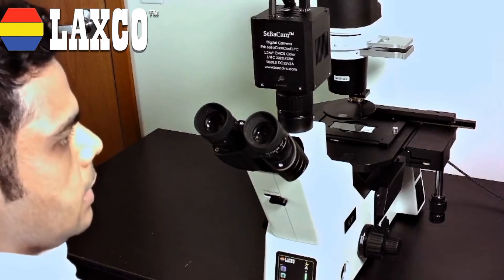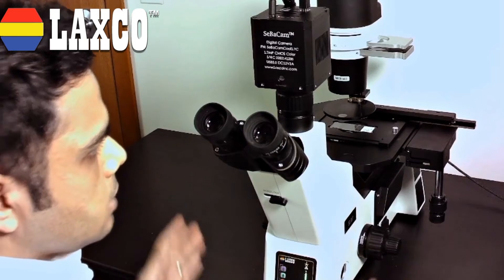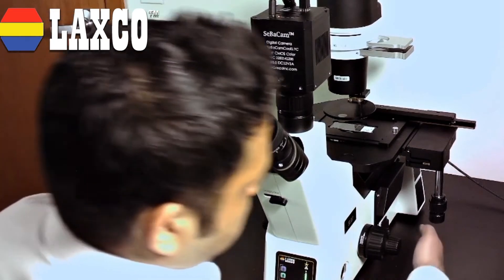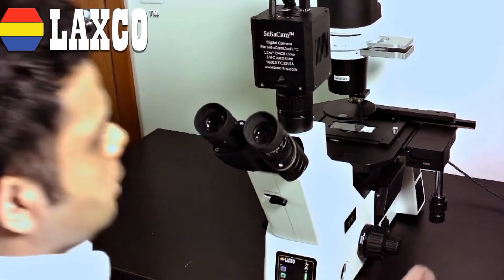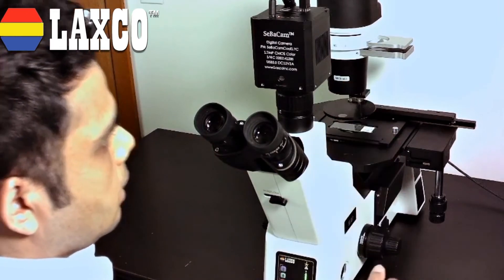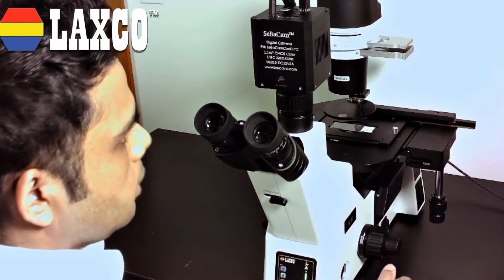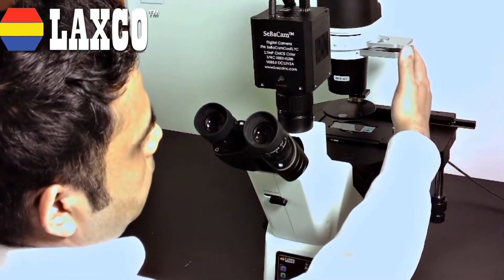Here we have the SLI 6 Pro Inverted Fluorescent Microscope. It has all the basic functions of an inverted microscope. You have your focus knob situated here. You can turn on and turn off the microscope with the on/off switch located here. This is a trinocular system so it can also be upgraded to have a high intensity camera. The light source is located up top — this is for your bright field and phase applications. I have the phase and the daylight filters set here.